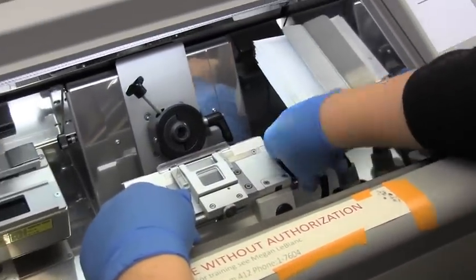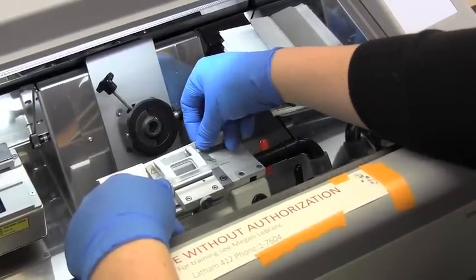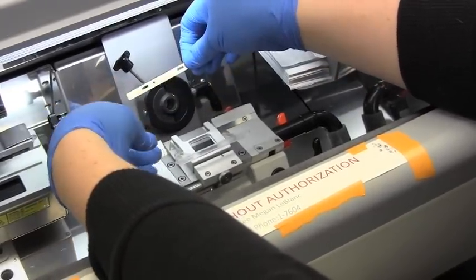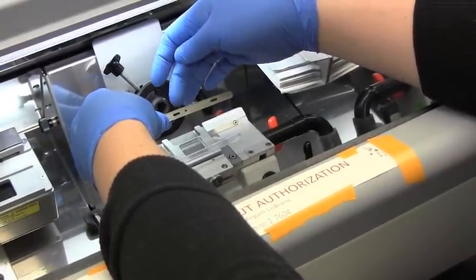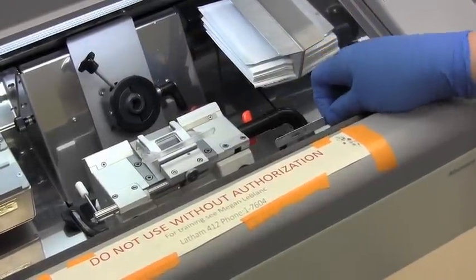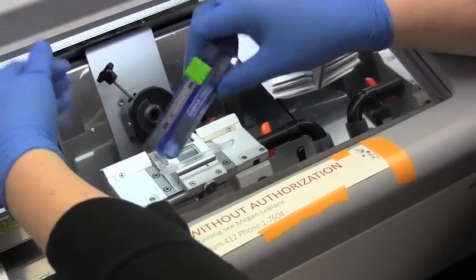Let's get the blade out so that we can be careful and not cut ourselves — release this orange bar. Move our blade protector out of the way; it's still fairly sharp. As you're doing your cutting, if you go through a sample, it doesn't hurt to release it and then move it over a few centimeters so that you can get a sharper edge again. The nice thing about these blades is that it comes with a handy disposal — you just slide it in and these blades don't come back out.